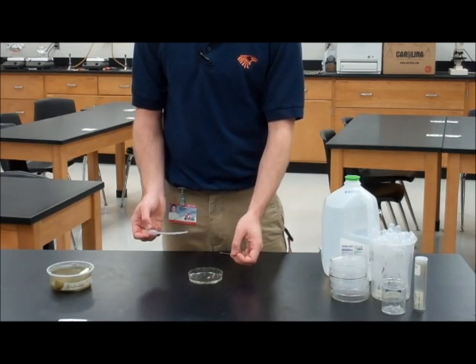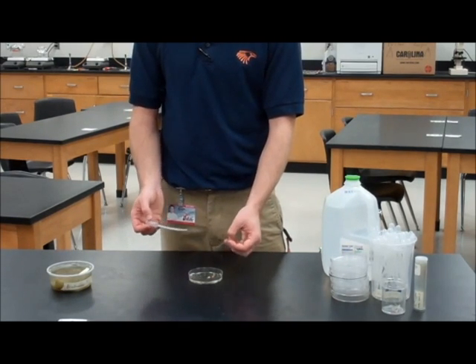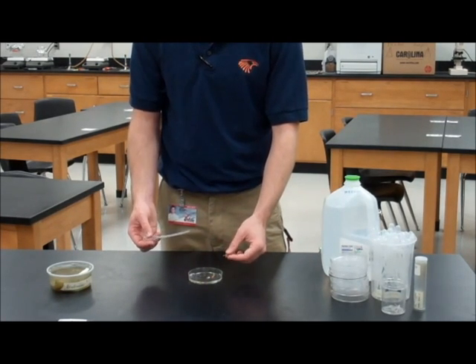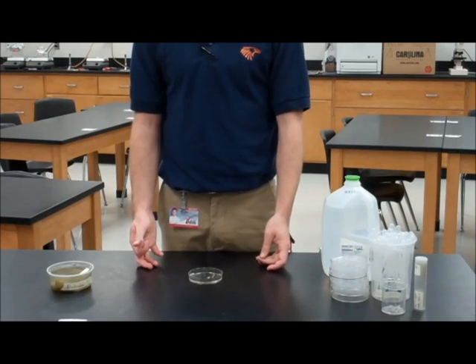This is a little bit of a tricky procedure, so be sure you practice. As you're practicing, remember to squirt over your puddle so that if or when you miss, they don't spill out onto the table where they can dry out.